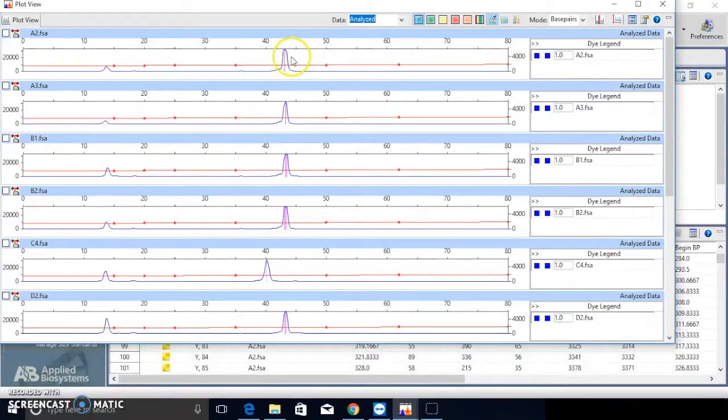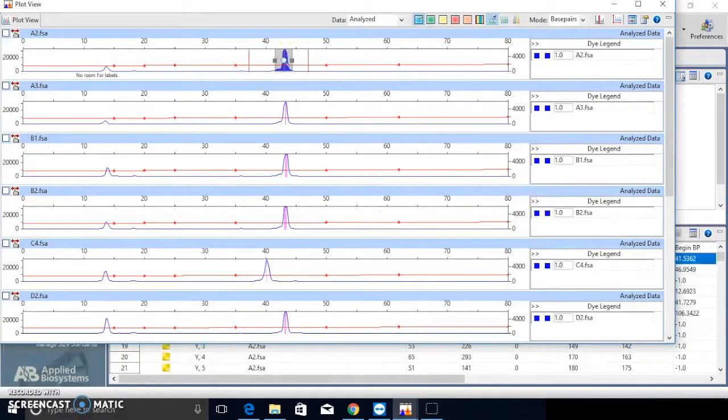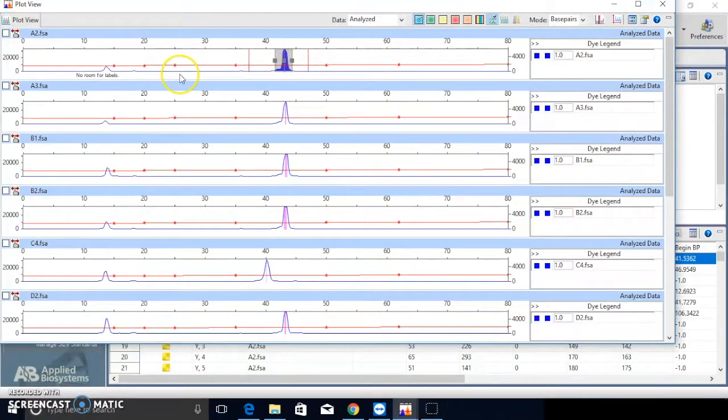You can click each peak for more details. The highlighted blue part is used for peak area estimation for each peak.